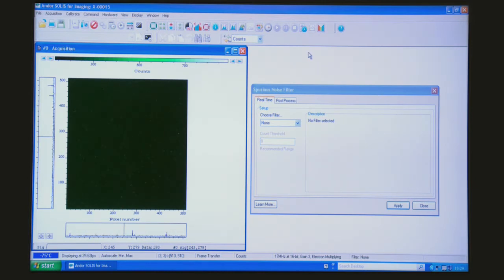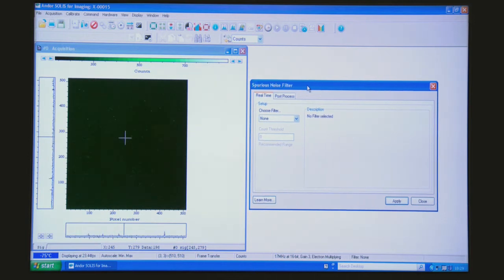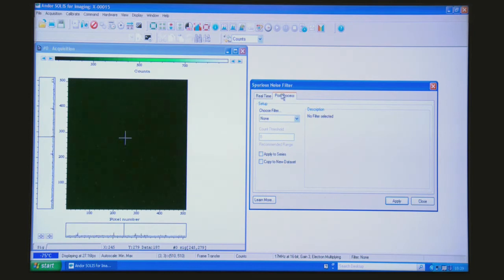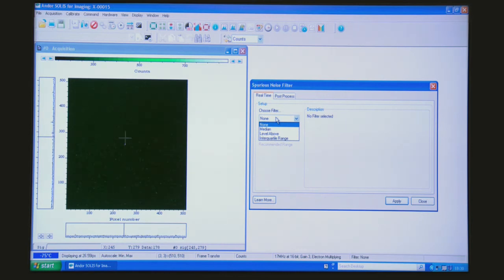So all we do, having opened up the spurious noise filter dialog, and we've selected real time—post-processing is also possible, but we'll run it here real time—is choose from one of the selection of available algorithms.